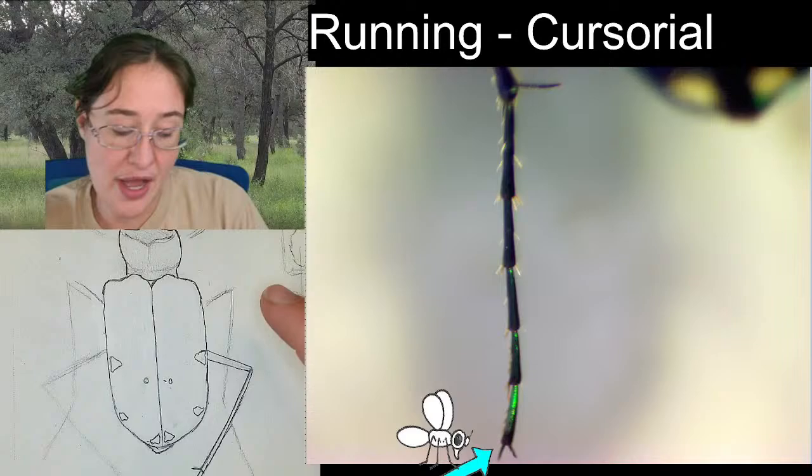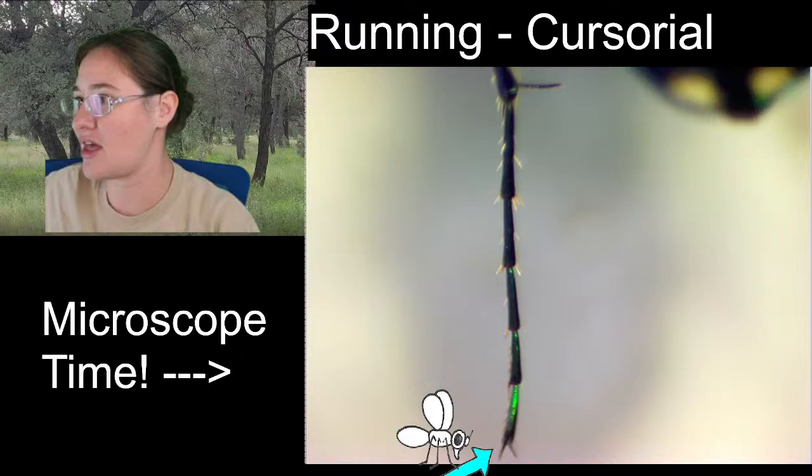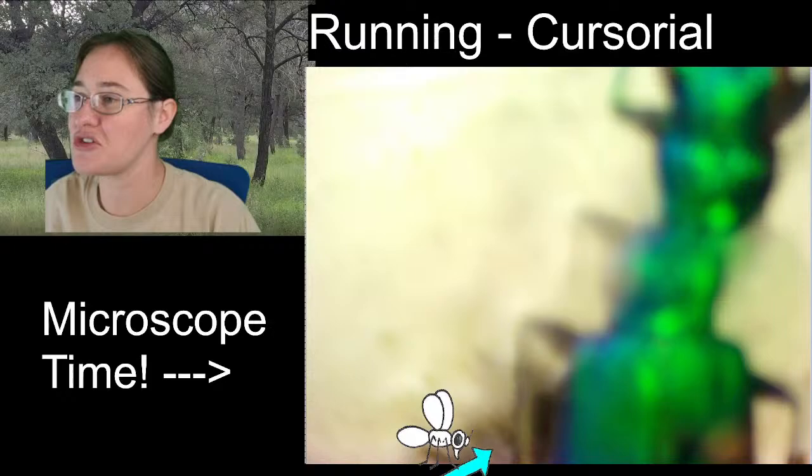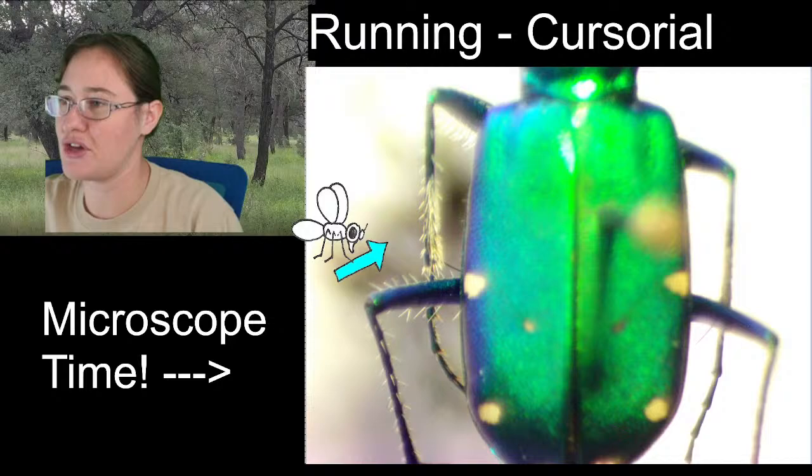Now, we're going to be coming up here, and we're going to be doing our middle legs. Admittedly, they're going to be very, very similar to our hind legs, so, alright, we'll move it. I was considering not moving the microscope, because they're going to be the same, but I'll go ahead and move it for you, just so that you can also see where exactly on the elytra the middle legs come out. And you might want to see that plume of hair on the middle tarsi. That's kind of fun.